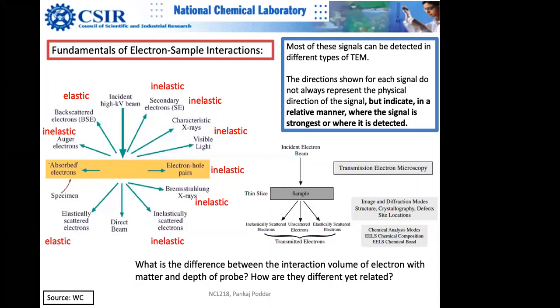So when I'm teaching this subject, microscopy, when I'm teaching you about sub-angstrom resolution, I would like to tell you that you have to completely throw away the conventional jargon taught till MSc or beyond, that the atom is spherical and the electron looks like this and there is a bond. There is nothing called a bond. The electrons spend time either here or there. It's a chemistry jargon actually. There is nothing called a bond, you can't see that. It's just electron distribution difference actually.